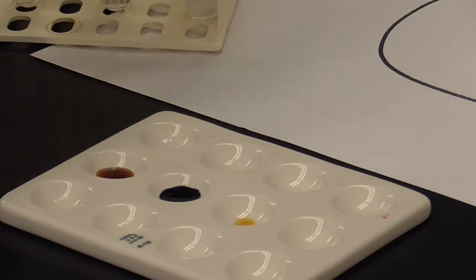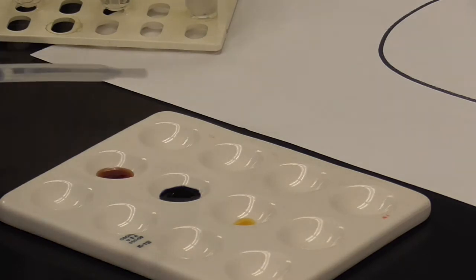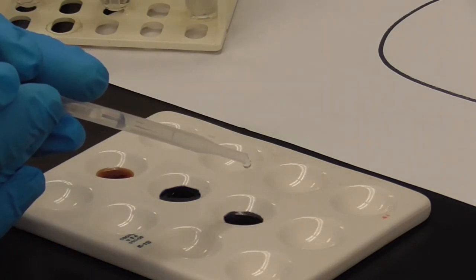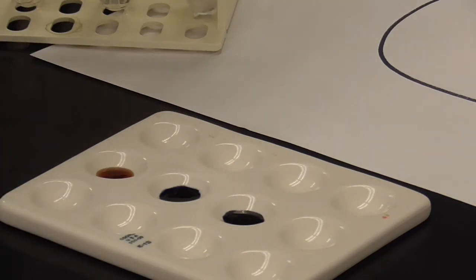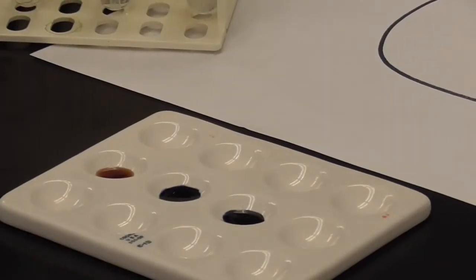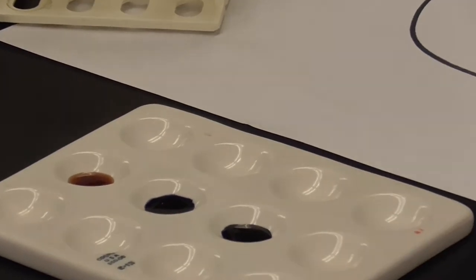And at 0 degrees, 1, 2, 3, 4. Also dark blue. That's a very different result than you'd find in normal chemical kinetics. So enzymes respond differently to temperature than a normal chemical reaction would.